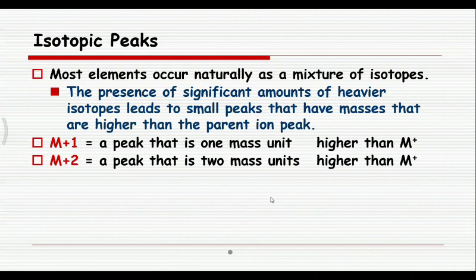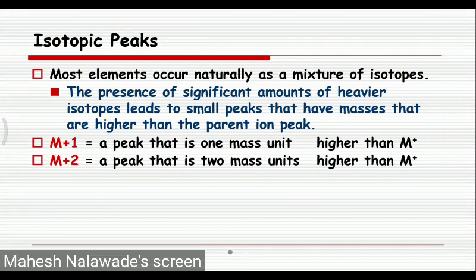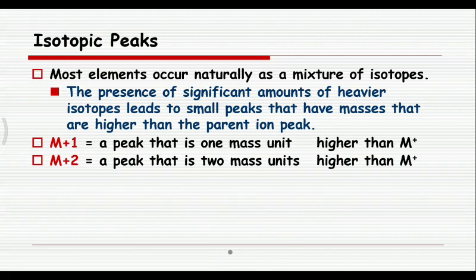Okay, now it is okay. What we have for organic compounds or inorganic compounds, the elements like hydrogen, carbon, halogens, we have fluorine, oxygen, nitrogen, all these are having isotopes.